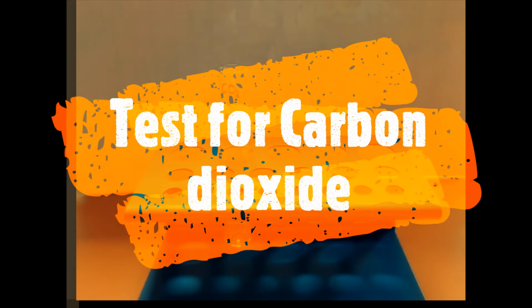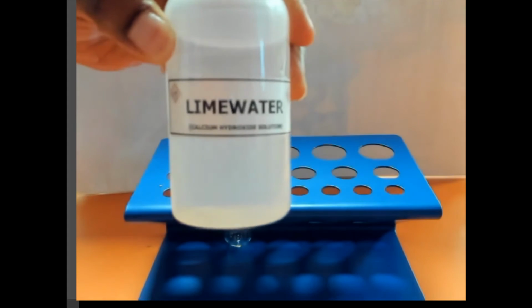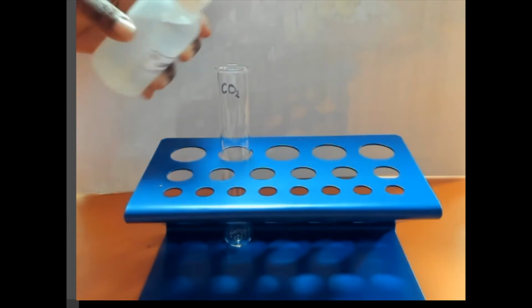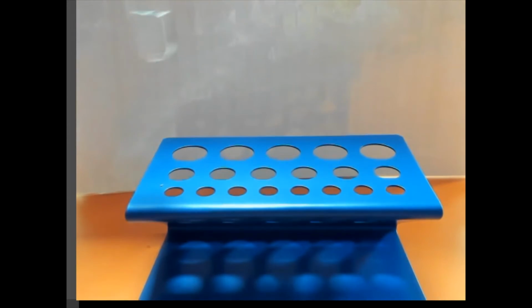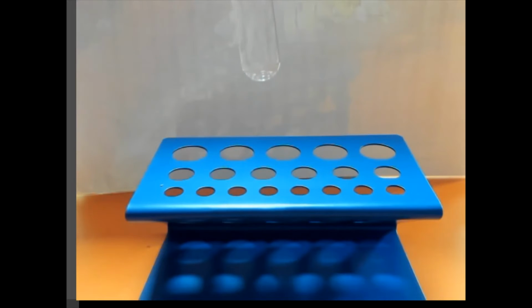Okay, to test for carbon dioxide, I'm going to be using lime water. Now, lime water is an aqueous solution of calcium hydroxide. So I'm going to pour my lime water into the test tube. The color of lime water, it's actually colorless. It's a colorless solution. So you can see it's colorless. And then what I'm going to do is blow some carbon dioxide into this lime water.